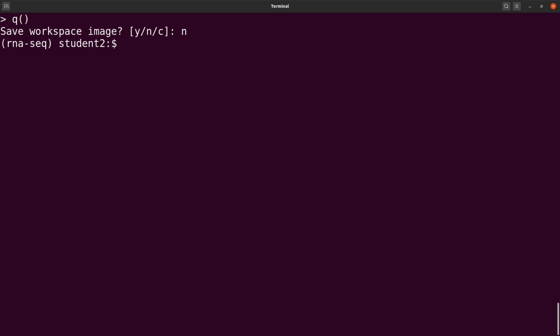So now we have all the packages we need installed. So we are now ready to start the analysis. So let's clear the screen and continue.